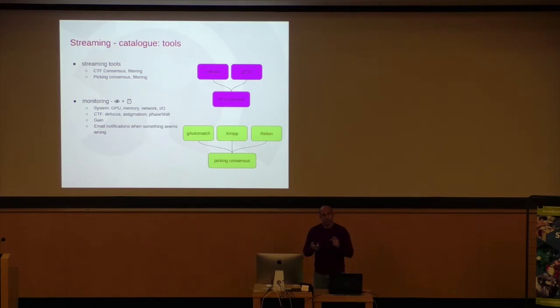This will compare the output of both protocols, and it will filter. So if, let's say, I'm getting a resolution, you can set thresholds. If the resolution is above a threshold I don't like, then I will remove it and filter.